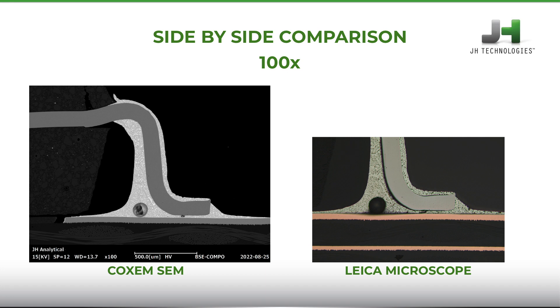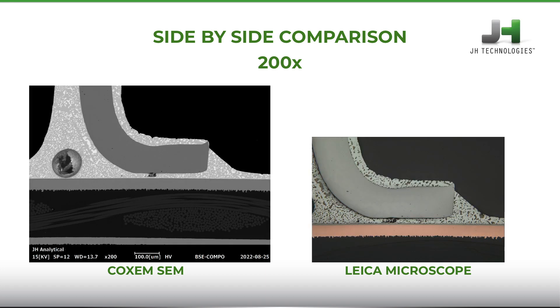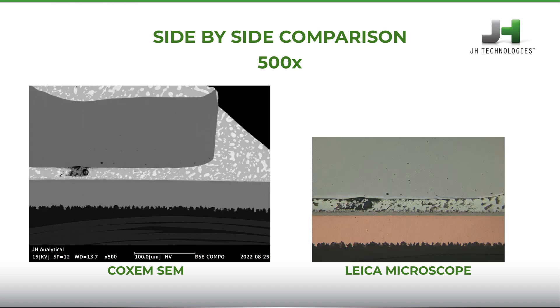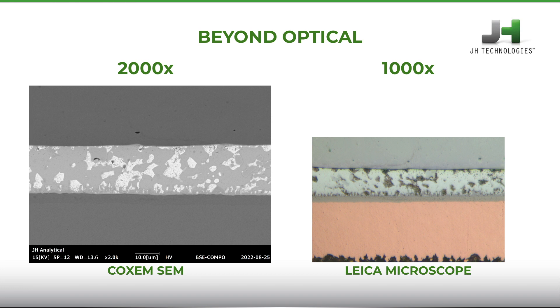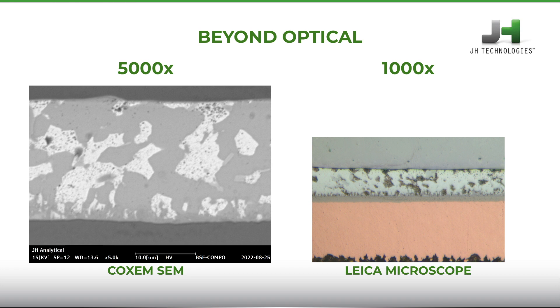SEM images are always monochrome. Here is the same sample at 200x on both systems. Once again, the same sample at 500x on both systems. Notice how much larger the field of view is with the SEM. The same sample at 1000x — notice the clarity of the grains in the SEM image. At 2000x, we have surpassed the capability of the microscope, and we can go even higher with the SEM, providing you even more details about your material.